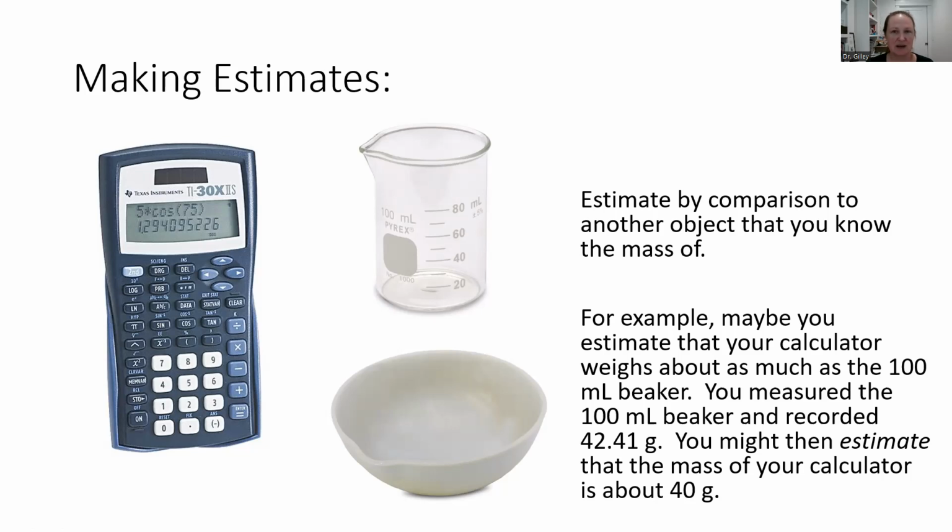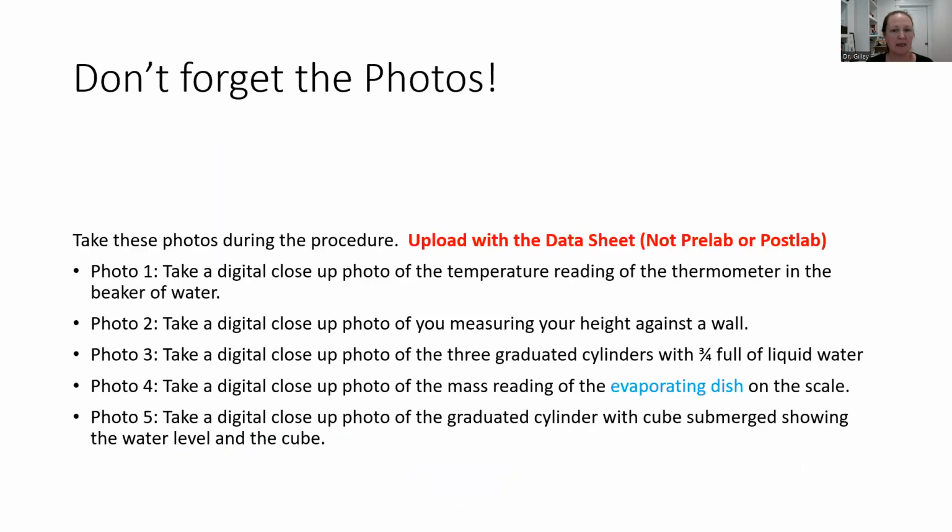So that's the idea. Compare it to something you might know the mass of and just try to make your best guess. We're just looking that you write something down that doesn't have the same level of precision as if you actually measured it and is somewhat reasonable.